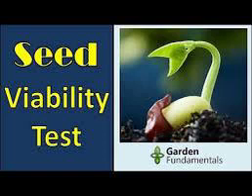Speed of germination. 100 seeds in four replications are planted in the recommended substratum for germination. Then they are kept in a germinator maintained at the recommended temperature for the crop in reference. The number of seedlings emerging daily is counted from the day of planting the seeds in the medium till the time germination is complete, and the germination index is computed as follows. A seed lot having a higher germination index is considered more vigorous.